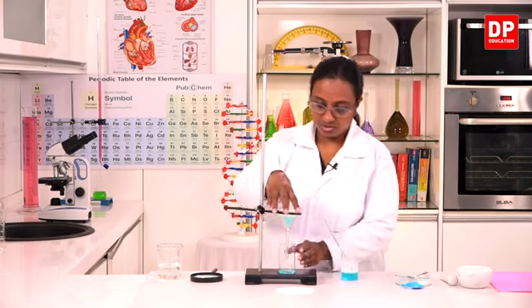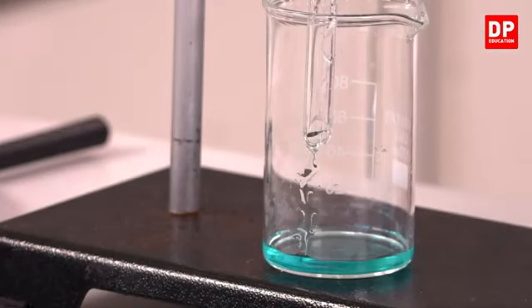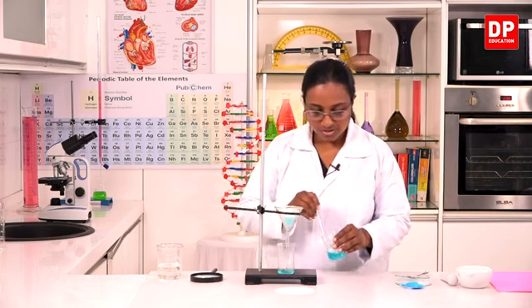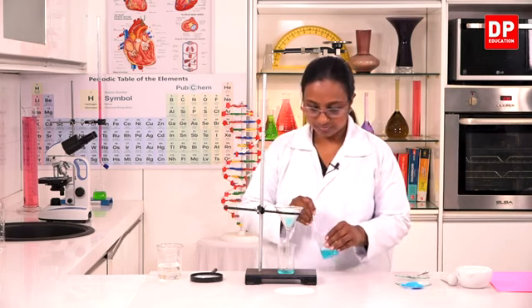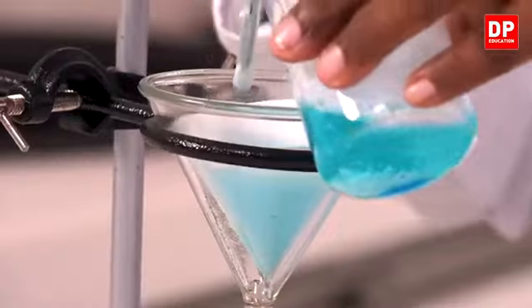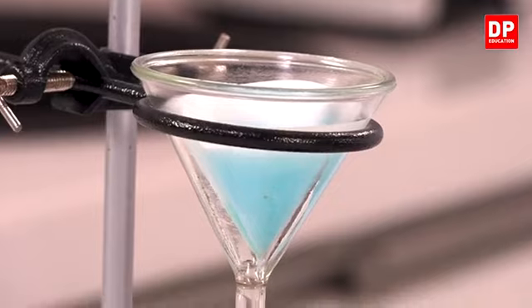If I touch it to the wall, then it will flow faster. You have to make sure that you transfer all the components. Still the mixture is getting filtered.